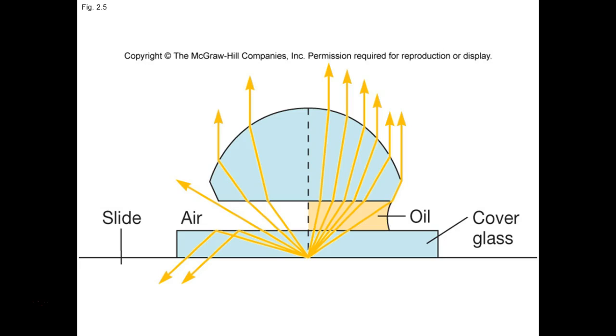So this helps too, but also think about this as we go to the higher magnifications, less light is getting through altogether. Sometimes students at the lower magnifications decrease their light, whether that's the iris diaphragm in the condenser or the light intensity wheel on the microscope. And then when you get to oil immersion, you can't see anything because it's too dark. You've got to let more light in. Open up the iris diaphragm, increase the light intensity, and then wow, the world is beautiful.